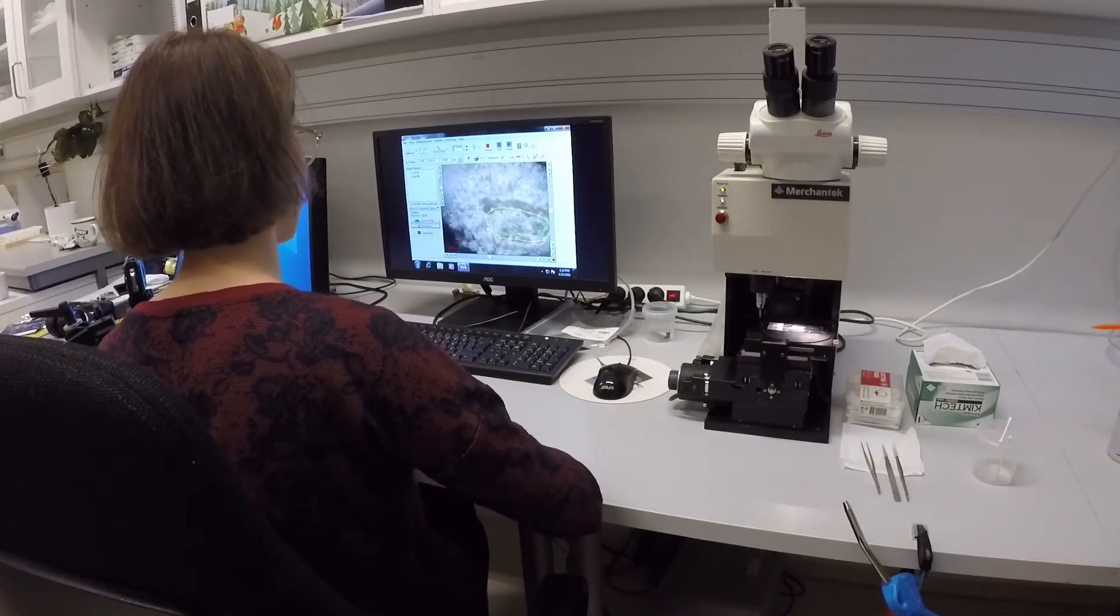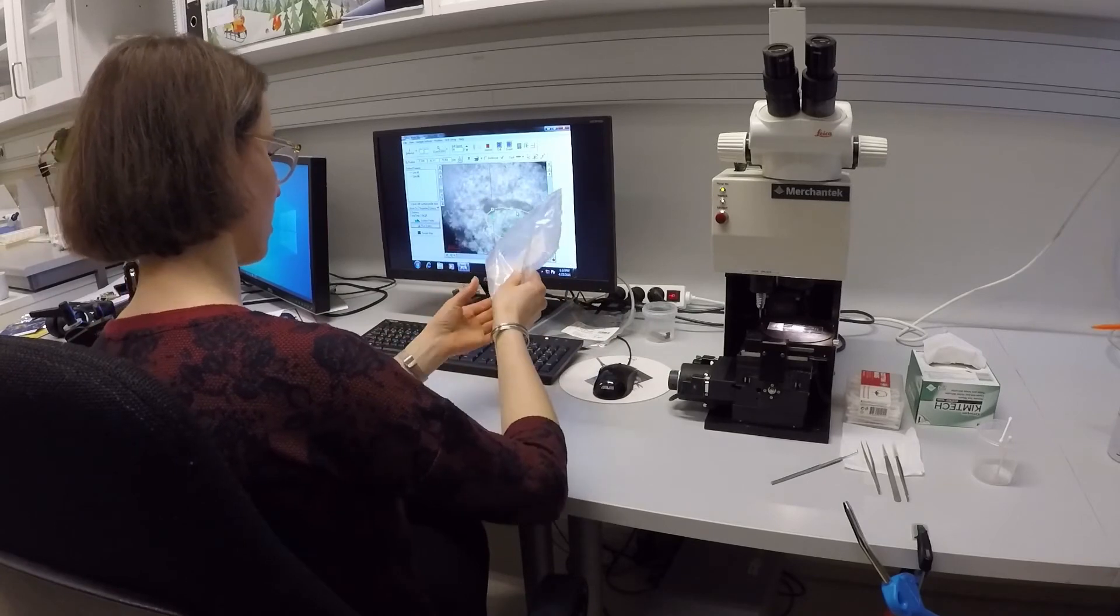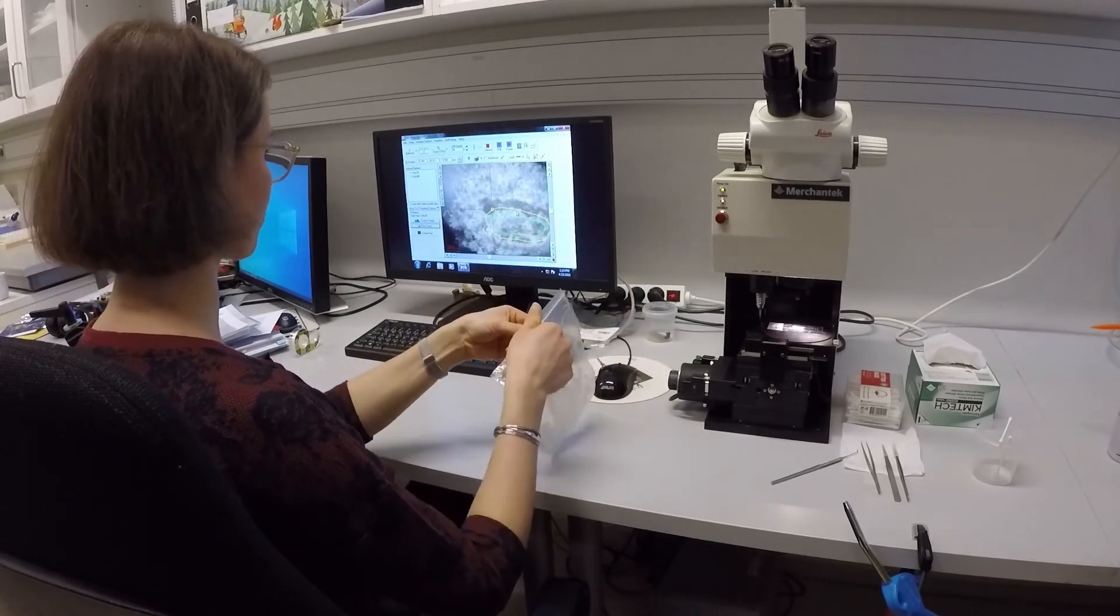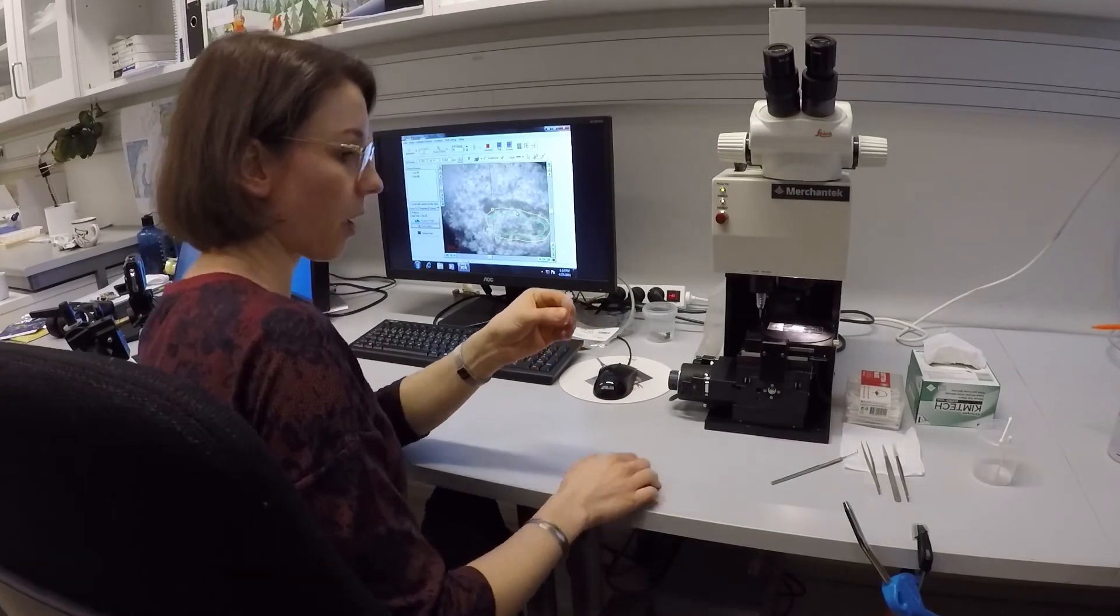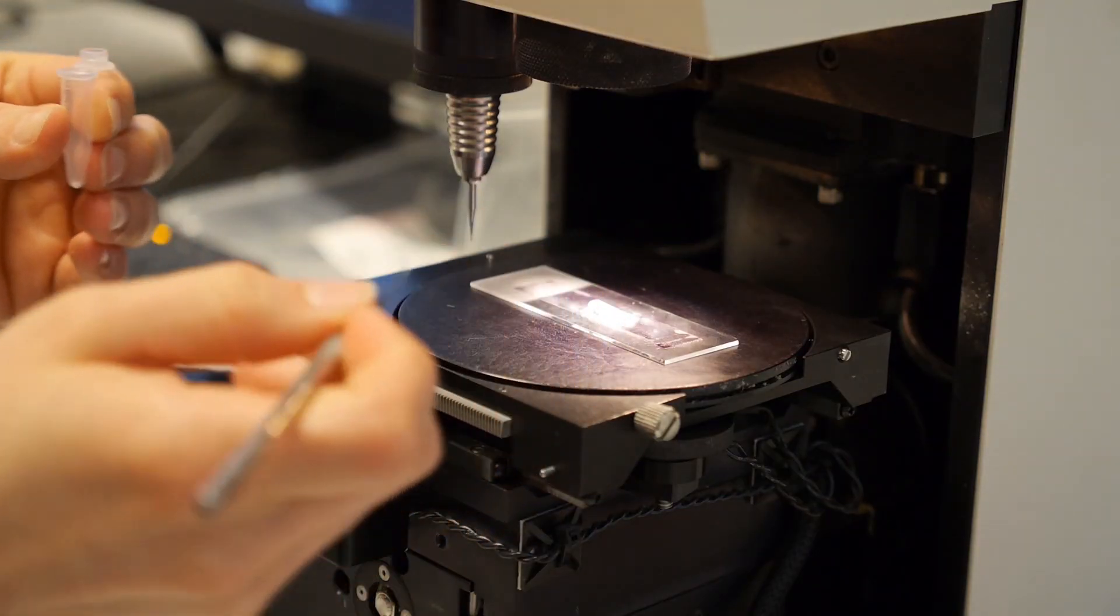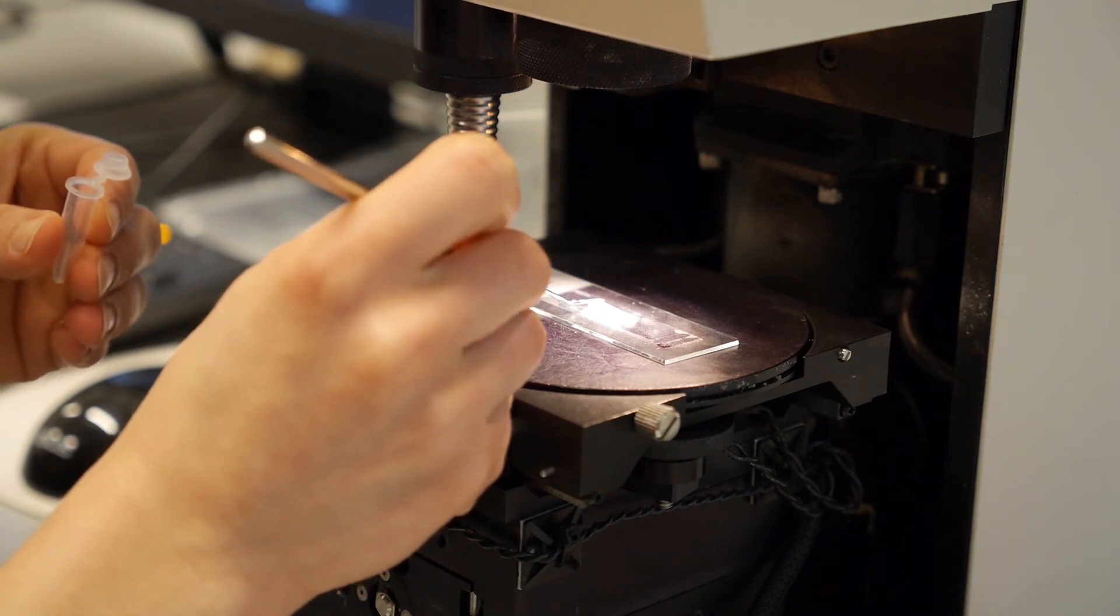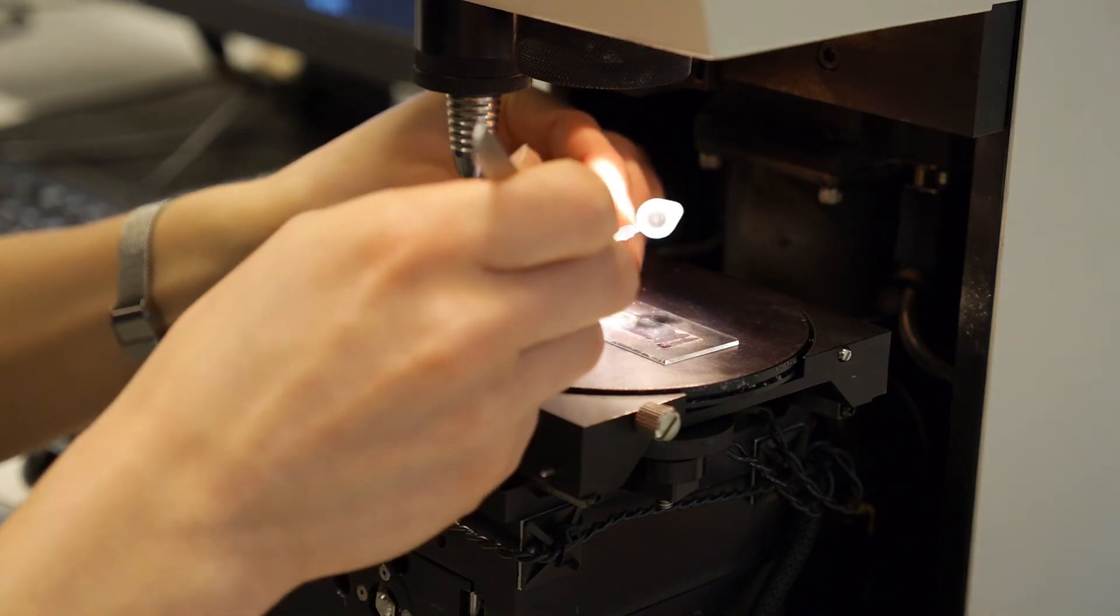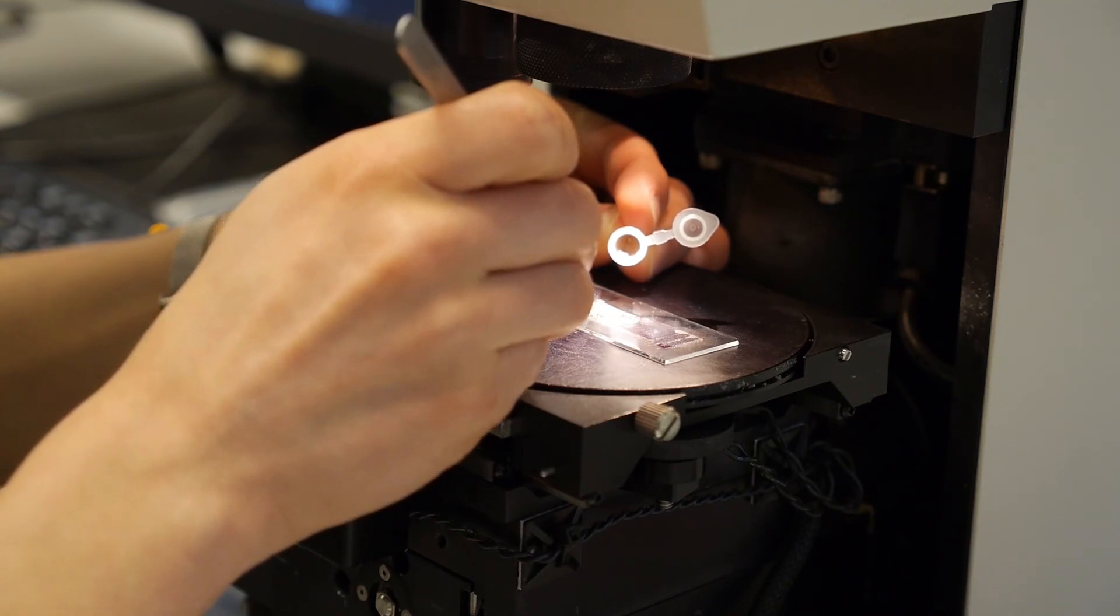So there are these small tubes here, which I previously cleaned with MilliQ water. So it's a little conical vial? Yes. Any kind of Eppendorf cup does it. And then you use this curved probe. Exactly, curved probe. And this is a bit of a practice task. It's the best to kind of put it all together. I hope you can see it. And then use the forceps. We should also have another one. And then gently transfer it to the sample vial.